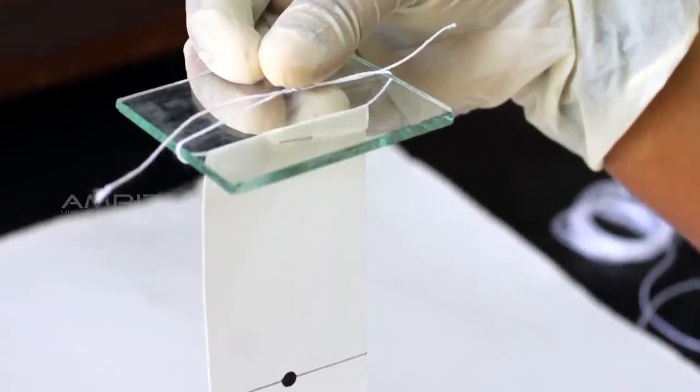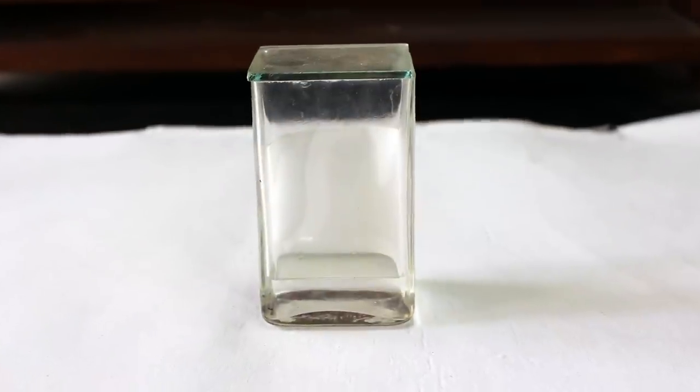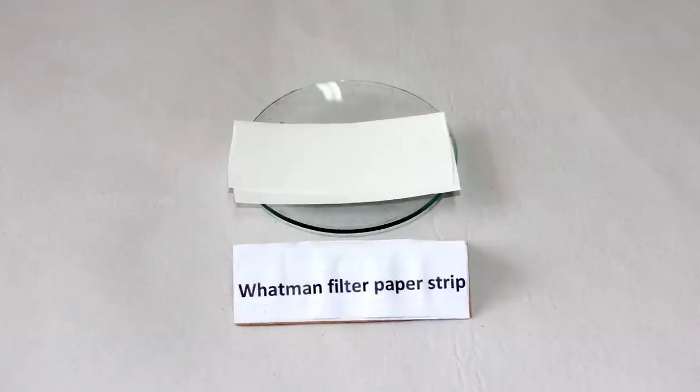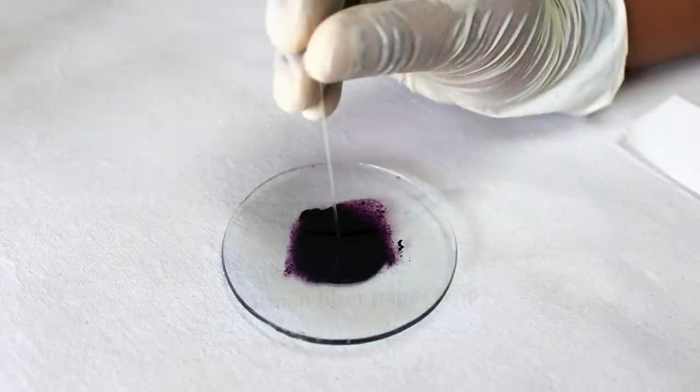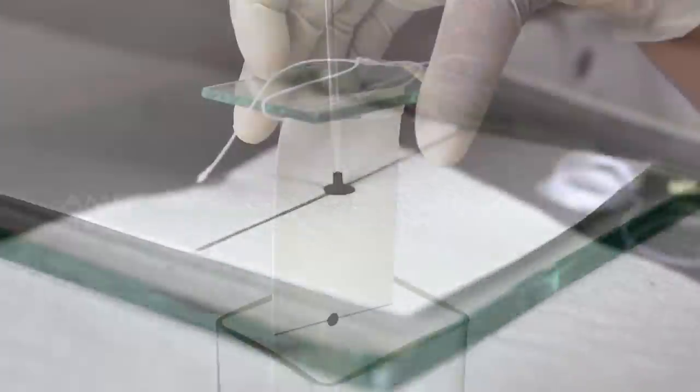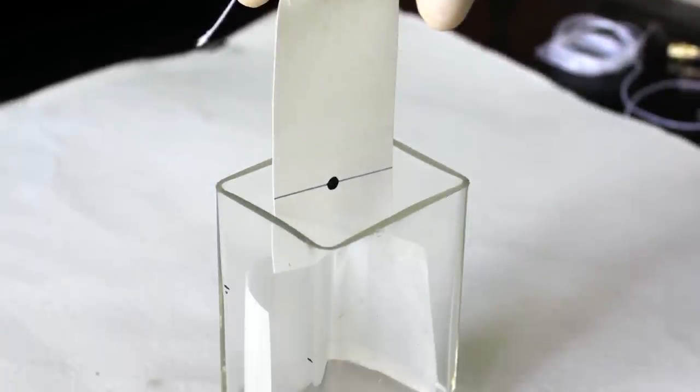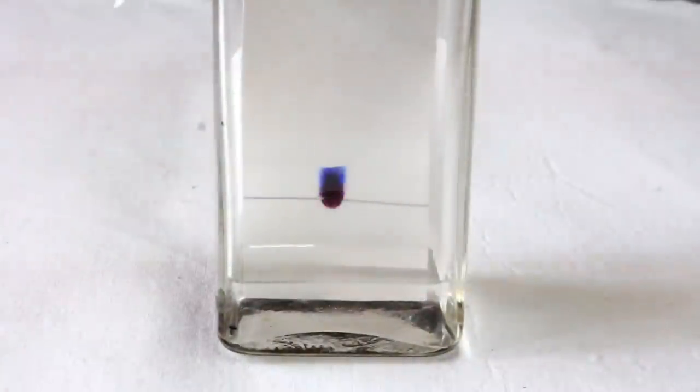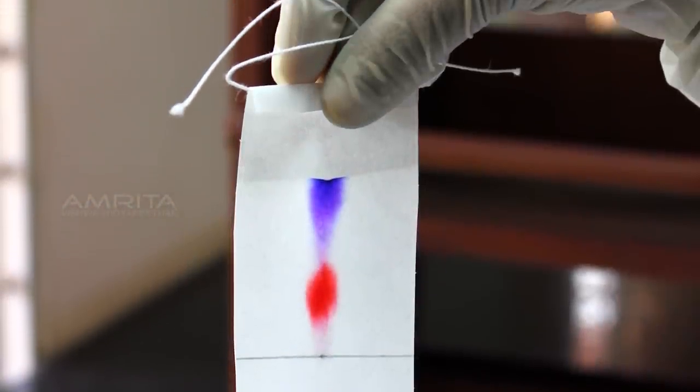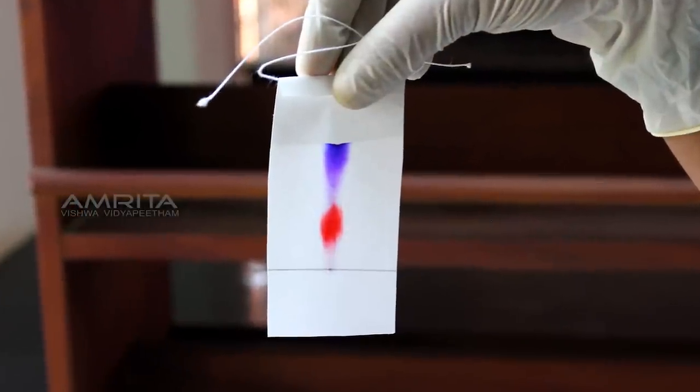Paper chromatography uses paper as the stationary phase and a liquid solvent as the mobile phase. In paper chromatography, a spot of the mixture is put on the paper and the paper is carefully dipped into a solvent. The solvent rises up the paper due to capillary action and the components of the mixture rise up at different rates and thus get separated from one another.